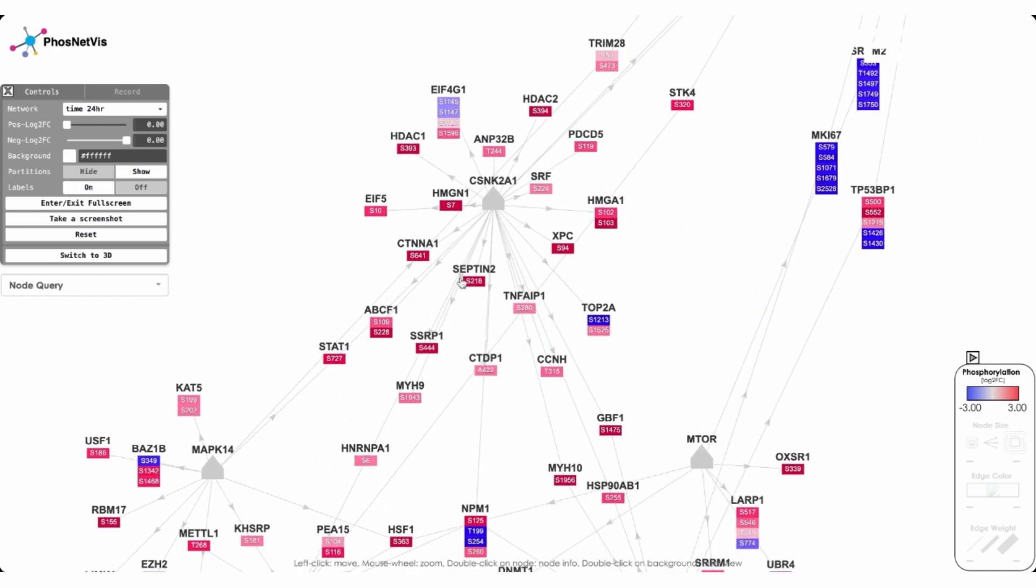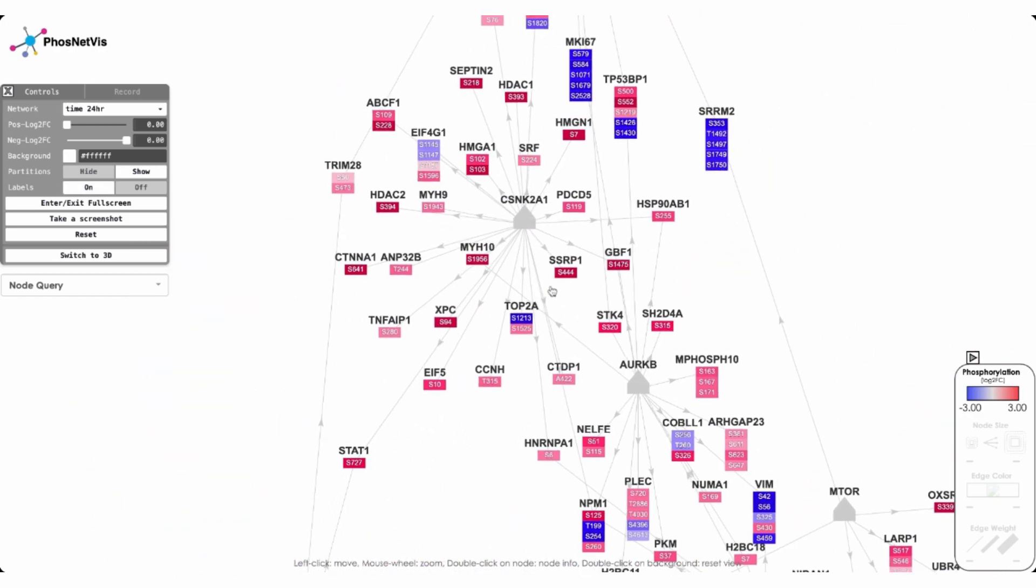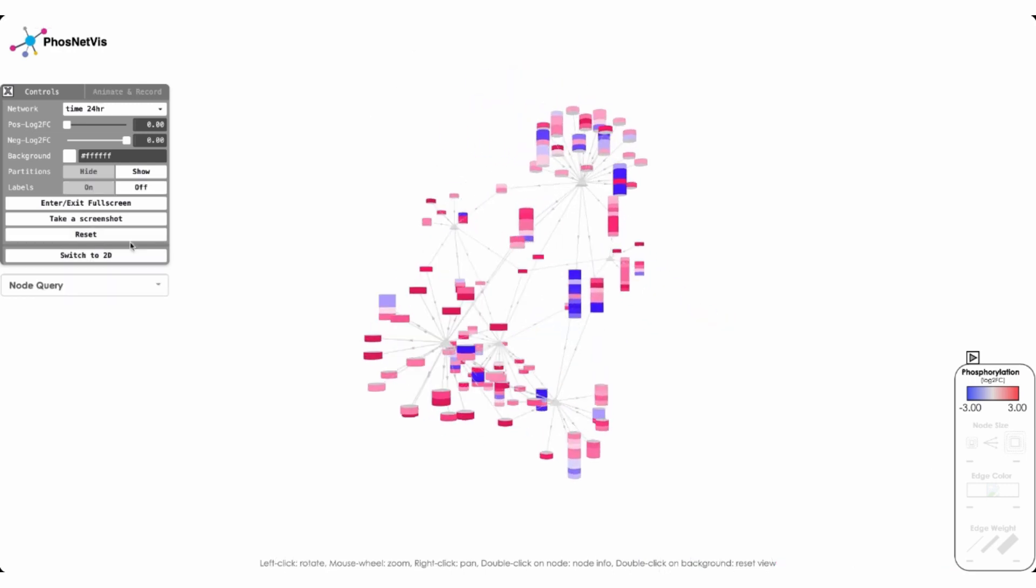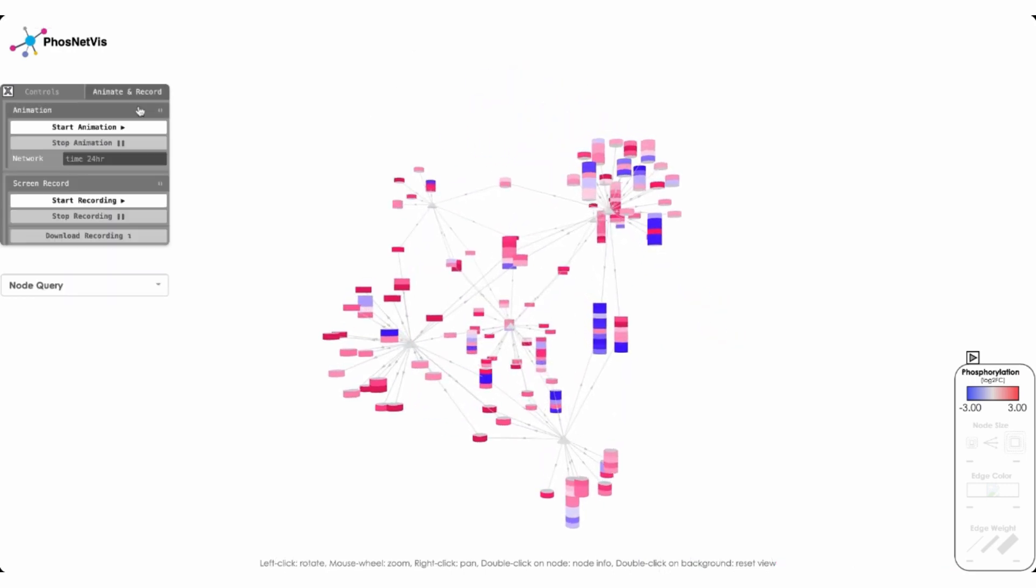And then we can see the same node in 2D. And here we can also see what are the specific sites that are phosphorylated on its target proteins and their levels of phosphorylation. And then here is the site ID. And let's go back to 3D. And in addition, we may want to see how this network changes over time.